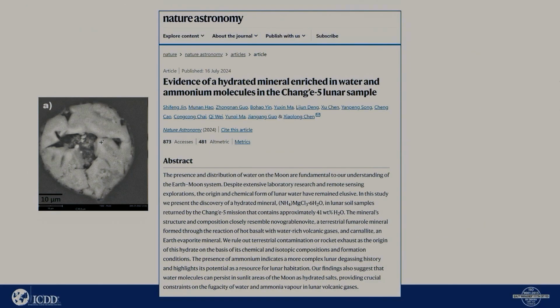Now, sometimes you don't have the powder pattern. Okay, sometimes you have a paper and someone has a structure, and you want to know, can I match that to something in the database? So here was a paper, and it was reported that some material that had been extracted from out in space and had been brought back to Earth, and they had the material to do the analysis on.